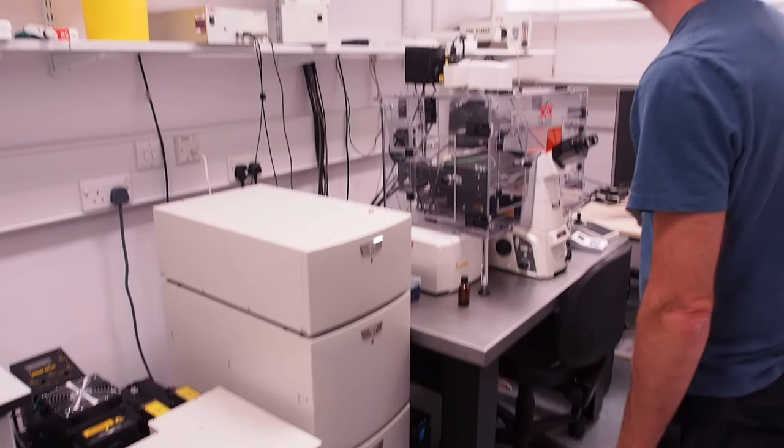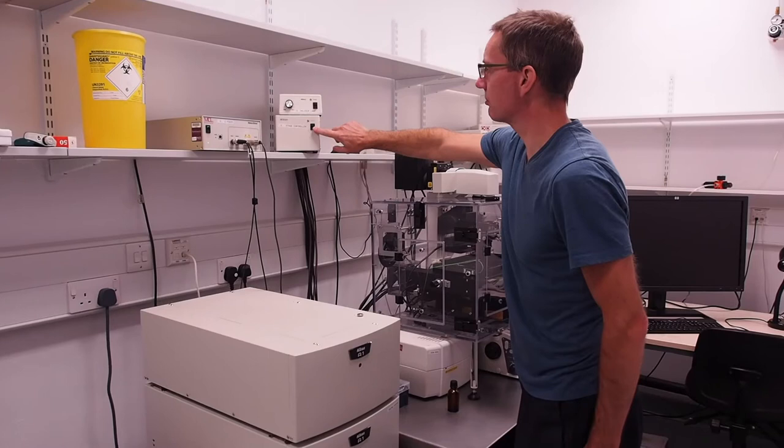Above the microscope on the left switch on the Z drive, the stage controller and the halogen lamp for transmitted light.